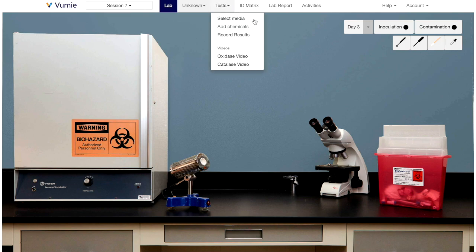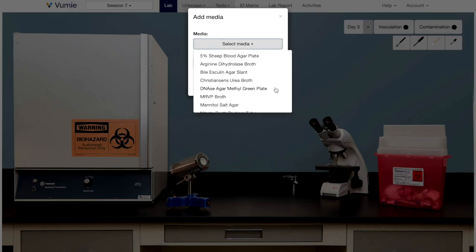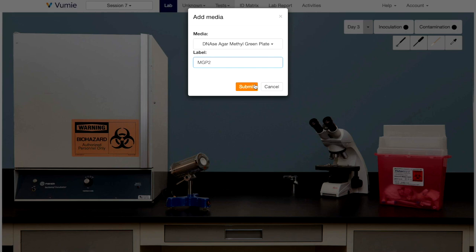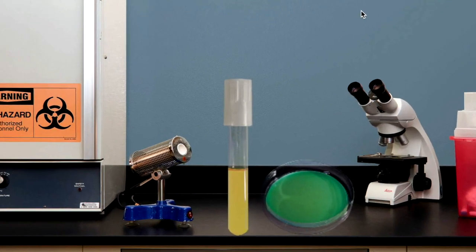First, select the medium to be inoculated. It will appear along with a pure culture of inoculum on the lab bench. Inoculum at left and sterile agar plate at right.